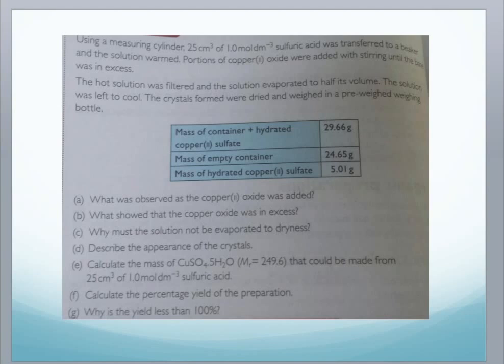So we are using a measuring cylinder of 25 centimeters cubed of 1 molar sulfuric acid was transferred into a beaker and the solution warmed. Then portions of copper 2 oxide were added with stirring until the base was in excess. The hot solution was filtered and the solution evaporated to halve its volume. The solution was left to cool. The crystals formed were dried and weighed in a pre-weighed weighing bottle. So these are the results.